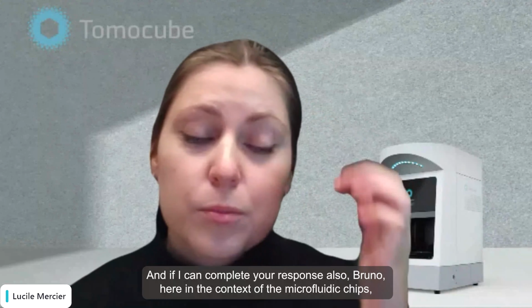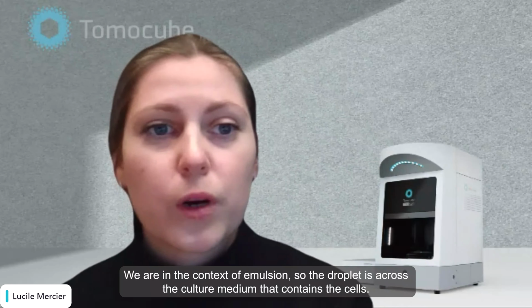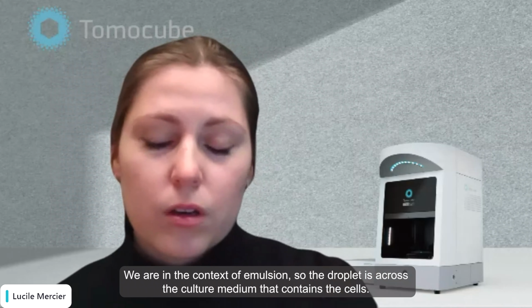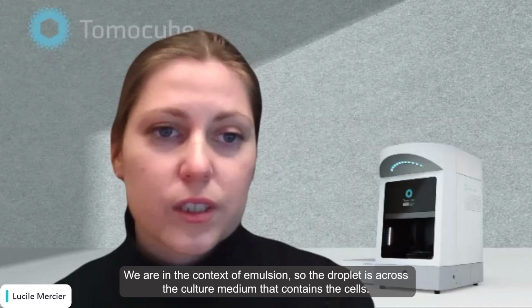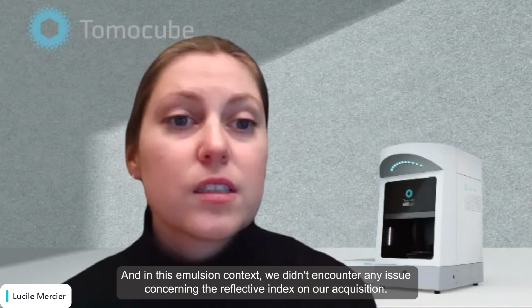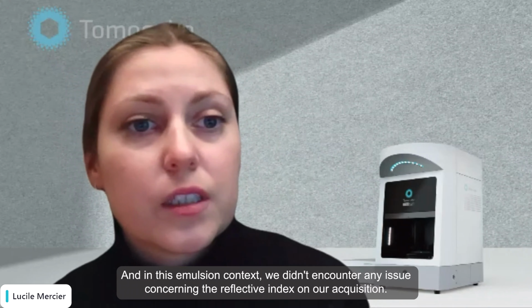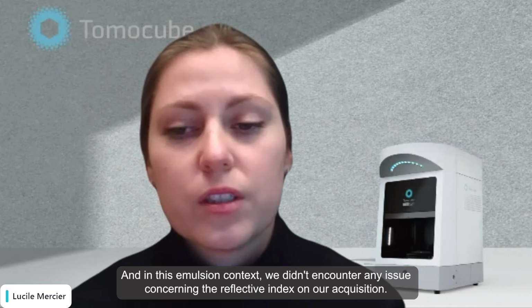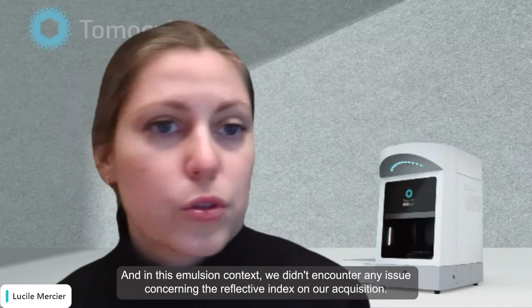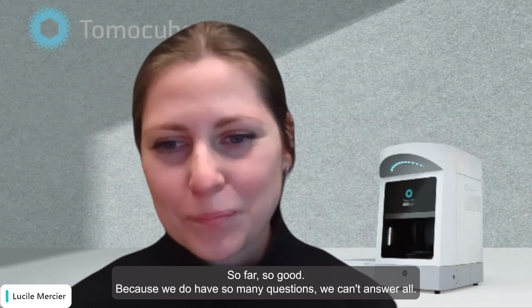And if I can complete your response also, Bruno, here in the context of the microfluidic chips, we are in a context of emulsion. So the droplet is aqueous, so it's the culture medium that contains the cells, and surrounding that it's the oil. And in this emulsion context, we didn't encounter any issue concerning the refractive index on our acquisition. So far, so good.